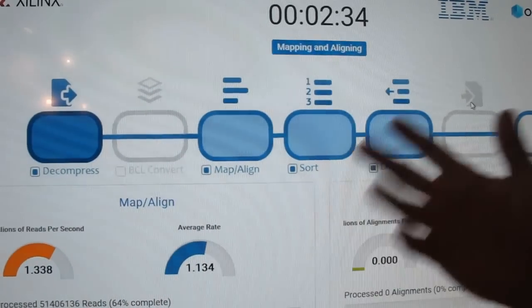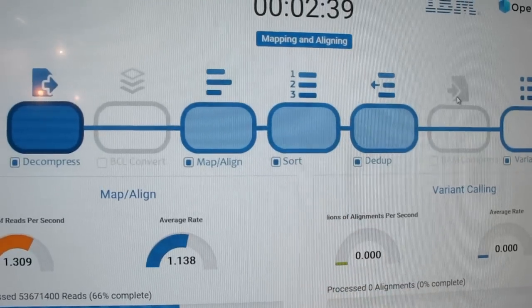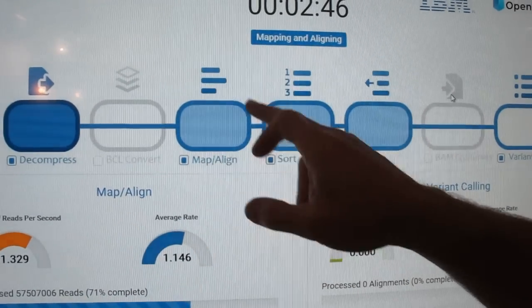So here we're running a small amount of data so we can finish quicker. After decompression, mapping and aligning is where you're basically reassembling that genome — mapping and aligning against the reference. And the FPGA is doing that step.